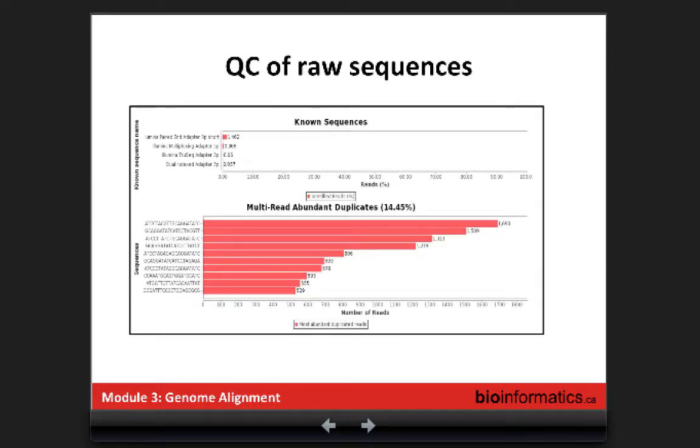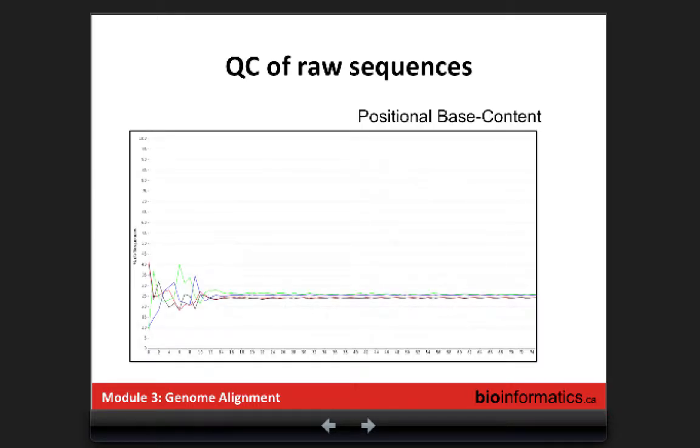But for whole genome, I tell you, if you see 25, 25, 25, there's probably an issue, because the GC content is not the distribution of all the bases in the genome. The GC content is around 60% or the opposite. So you should expect to have around 30 for two bases, and the other around 20. So two bars, if you do whole genome.